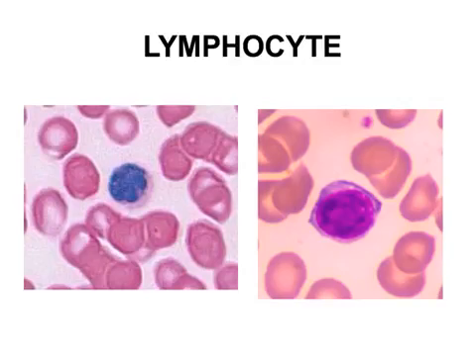Here we have our lymphocytes. Now as we look at our lymphocytes, notice that the nucleus is very large for the size of the cell, and it stains that dark purple color. Notice that the nucleus almost fills up the cell, leaving just a very tiny rim of cytoplasm. Now these are the second most numerous leukocytes, and they account for 25 to 35% of the total white blood cell count. If we were to see an increase in our lymphocytes, then we're going to suspect an infection such as mono or some type of chronic infection going on.